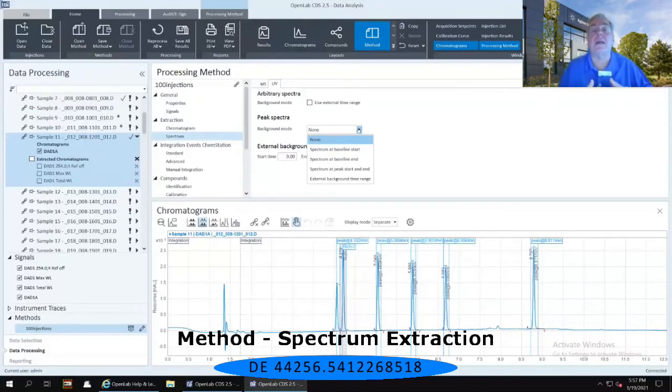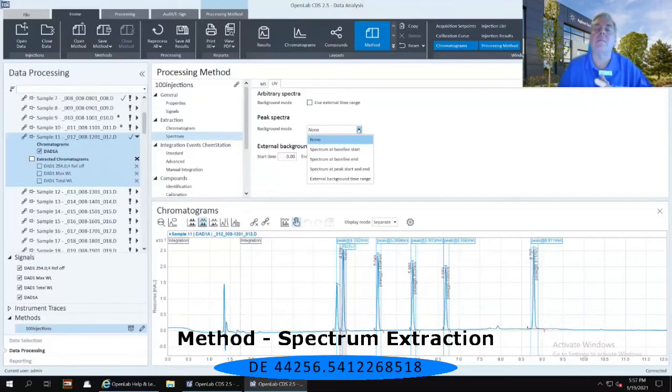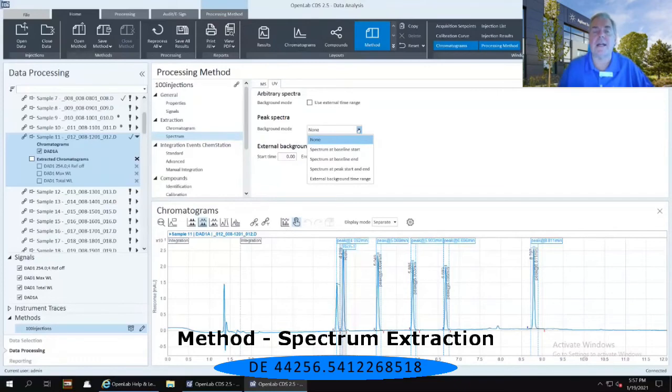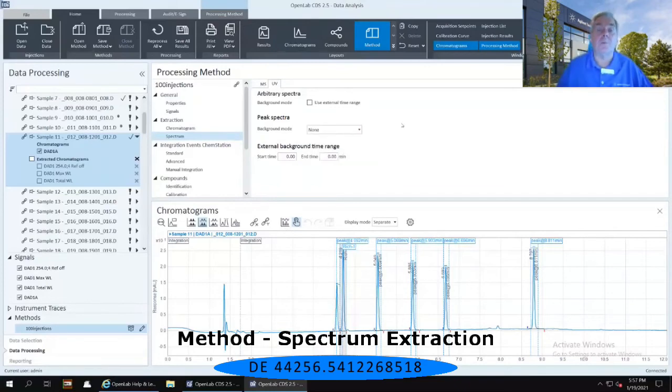I know in some of the environmental and chemical places, they do it at a specific time range. But these are all options that are available within OpenLab CDS.